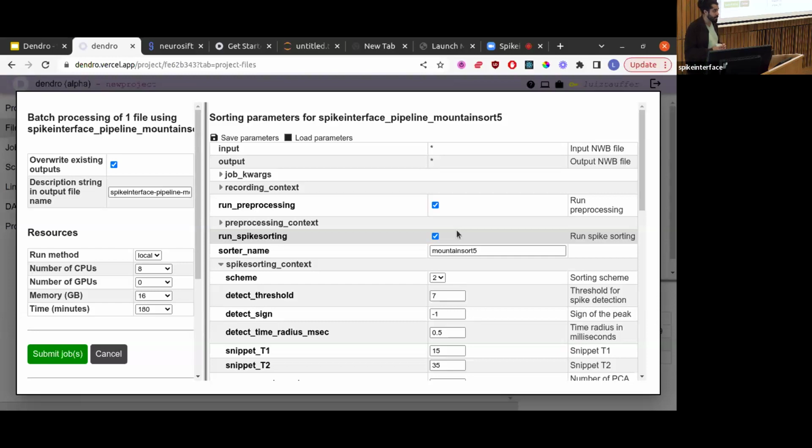Yeah, but you can actually do anything. It doesn't need to be SpikeInterface. This is a platform that's not meant to run only electrophysiology. Eventually, we want to bring behavioral tracking and video processing data as well. Actually, that would be our next step. The next projects, like queuing up or this type of stuff that we want to do, require heavy GPU processing.